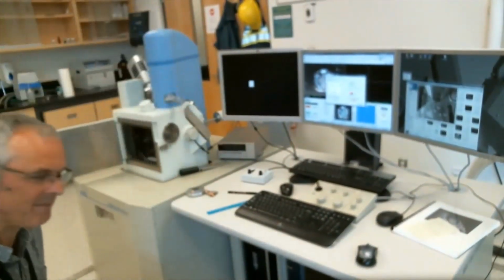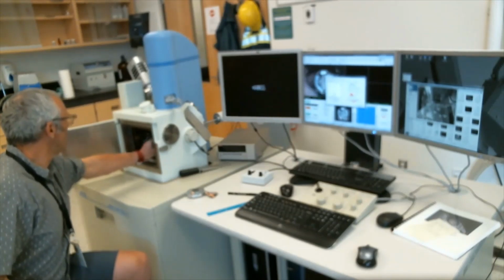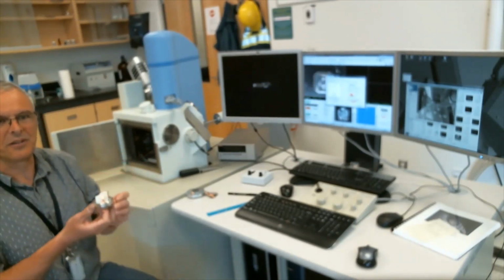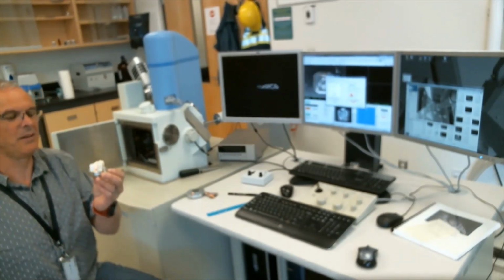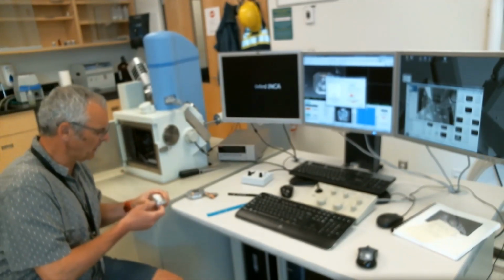Right. So we have a very large chamber and we can put big irregular samples in there like this particular piece of feldspar. So we can put large samples in.